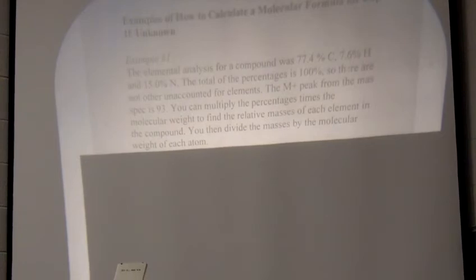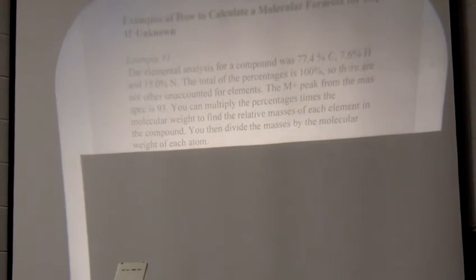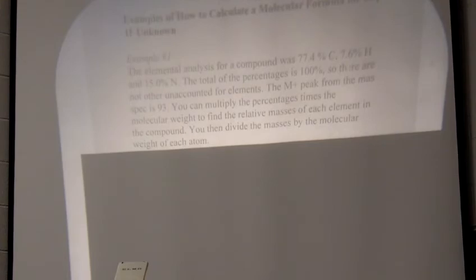That's why it's CHN analysis, because it's those three. So you'll have carbon, hydrogen, and if you have nitrogen, you'll also have nitrogen. That is how you will know if you have nitrogen or not, by that slip of paper. So don't lose it. It's just a little slip of paper with your unknown number and those percentages.